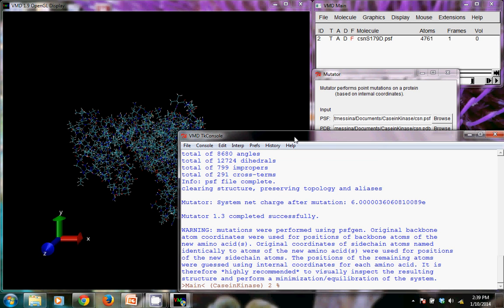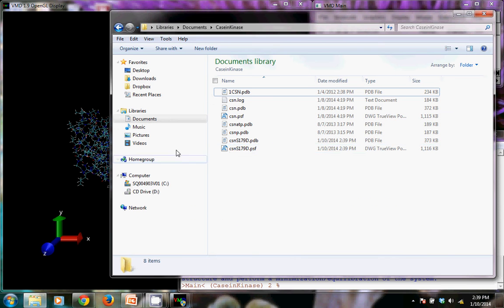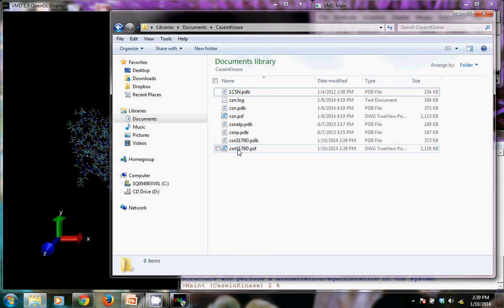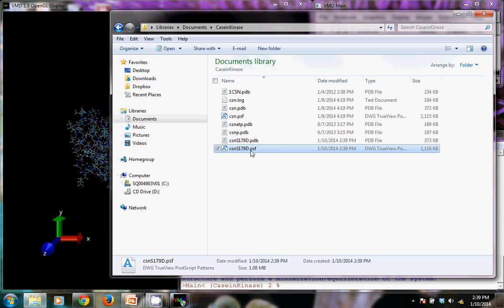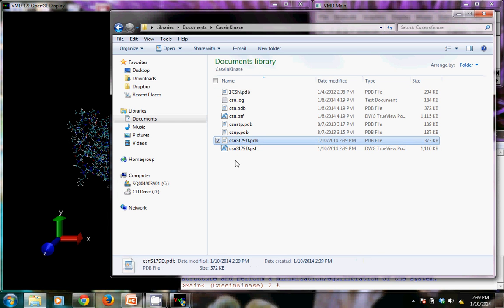And so we can do that by going into our explorer. And here are the two new files that actually automatically creates a protein structure file and a PDB file. Let's look at our PDB file.